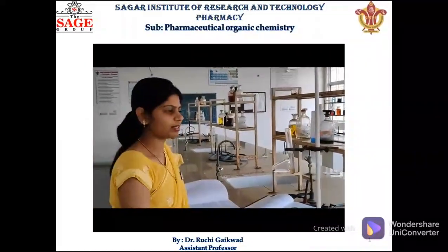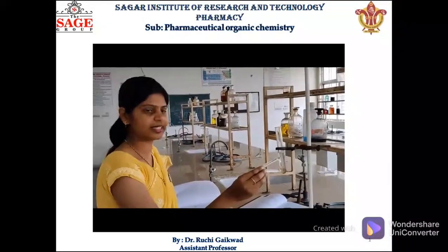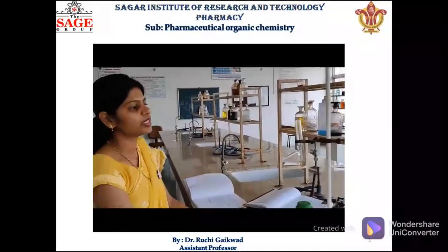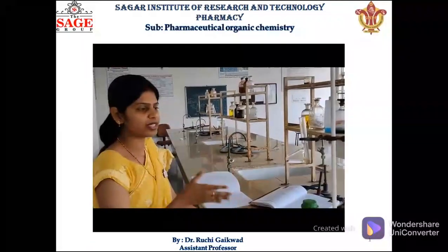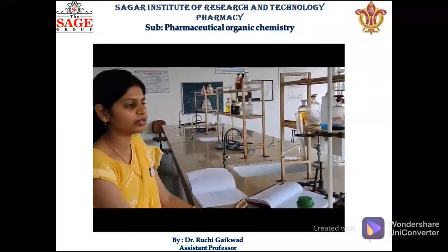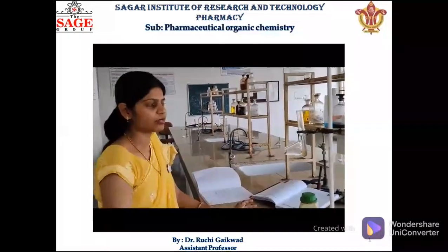Today we have started the determination of melting point practical. Let us start the practical of organic chemistry third, that is in your syllabus. First we have to discuss what the melting point is. Melting point is the temperature at which a solid compound melts into the liquid state. So basically this is the melting point definition.